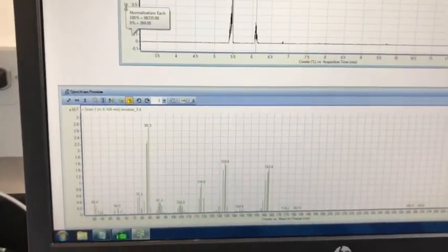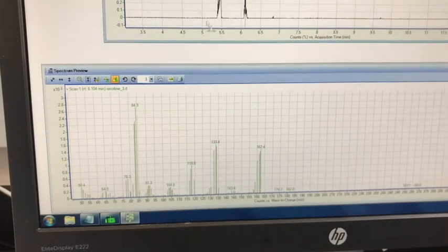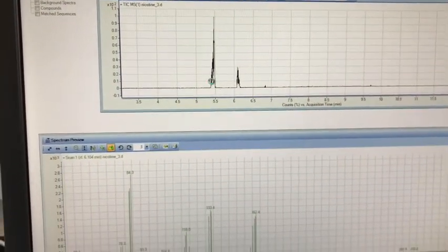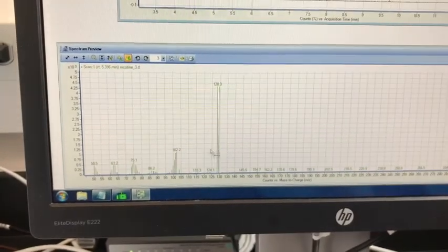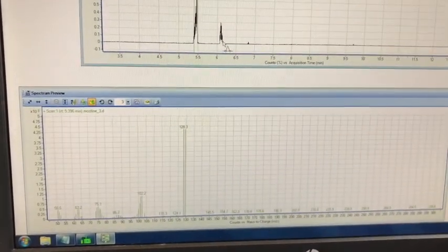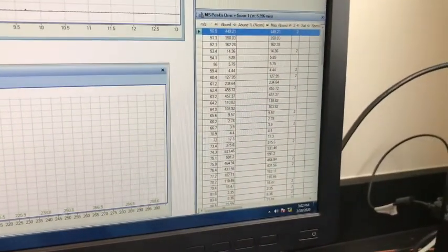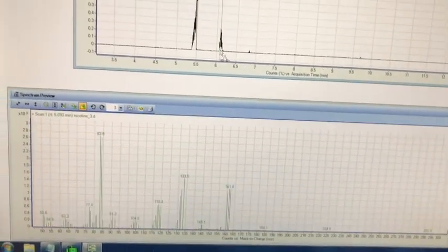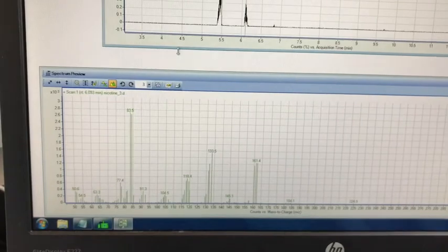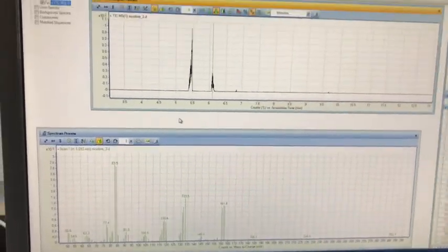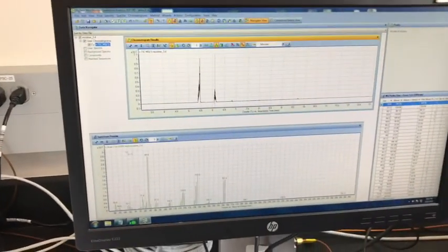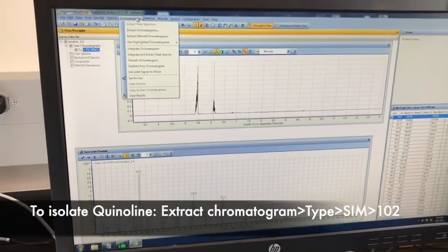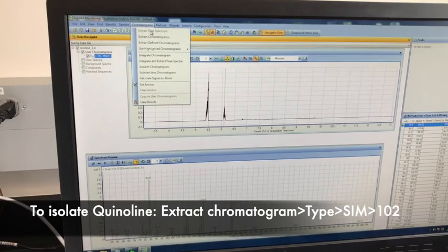In order to see the spectra of quinoline and nicotine, we double click on the quinoline peak and we'll see the mass spectrum of quinoline, with all the peak numbers and their abundance. If I click on nicotine, I can see the mass spectrum of nicotine. Now in order to isolate only quinoline or nicotine, we choose specific ions — we call that selective ion monitoring.